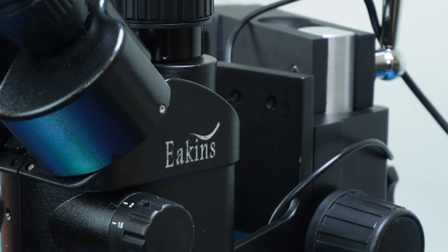This is Eakins brand and I bought it from the Eakins store. There are other sellers on AliExpress who sell the same thing but I got it from Eakins. You can tell that the pad printing looks kind of a bit dodgy. Supposedly if these are the Amscope ones, that pad printing normally wouldn't be there. But anyway, that's what it is.